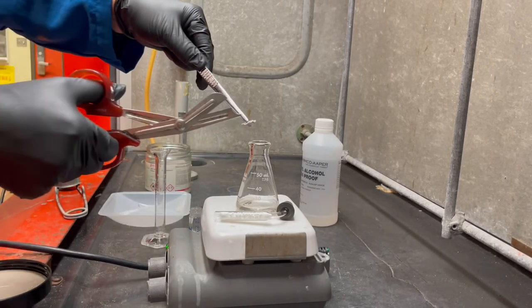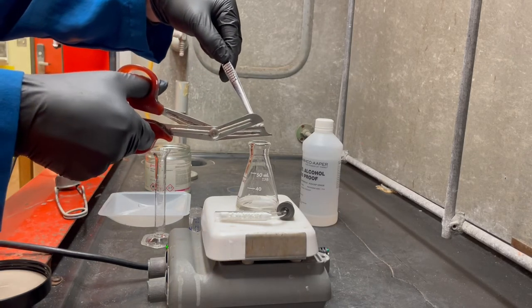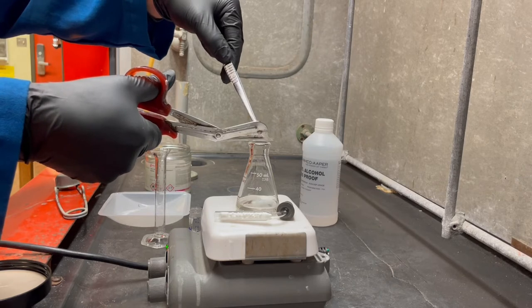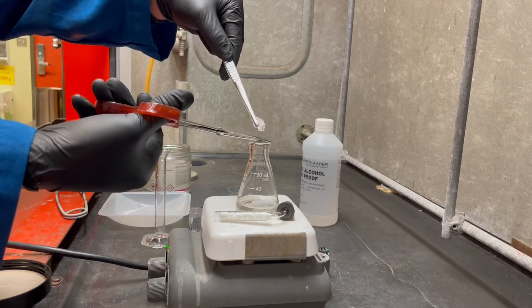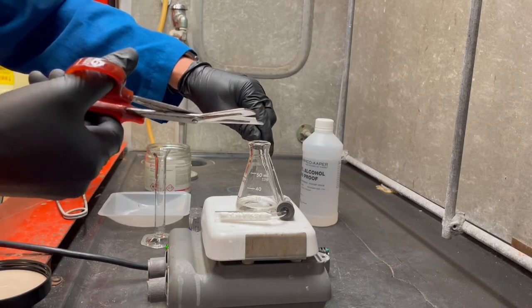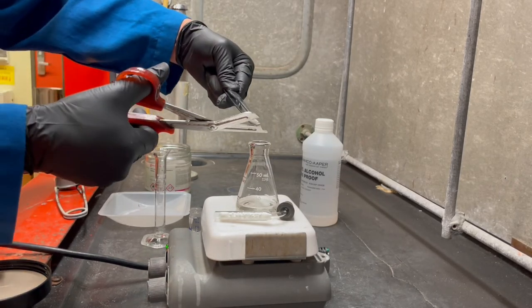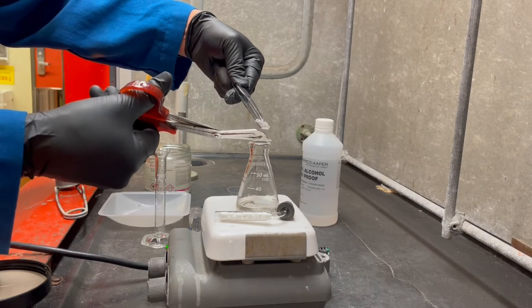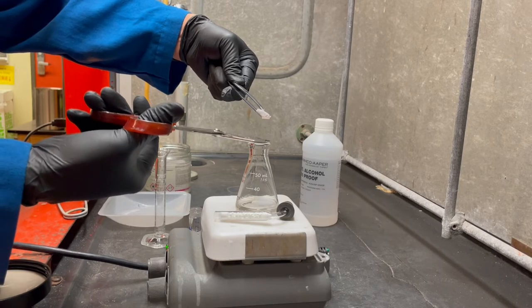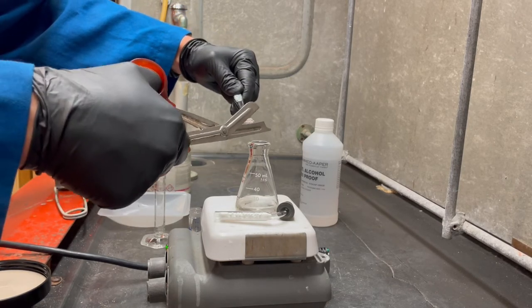And it's a hydrocarbon. It's not miscible with water, so it's hydrophobic, and there's generally not much water in it. And so when we place our sodium inside of that, water from the atmosphere can't really touch it because it's sitting in like this little barrier, right? But it's easily wiped off, and it's harmless when it comes to our reaction, so that's why we're comfortable using it.